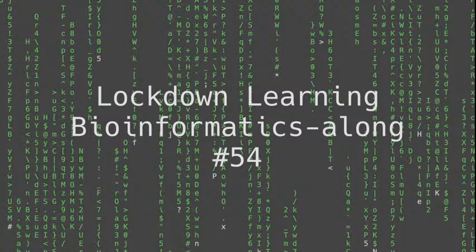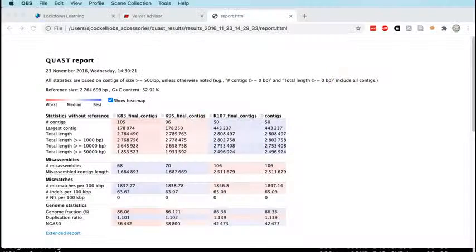So here we go. We've got some results from Quast here. This is a Quast report. You can see I generated it quite some time ago. This will have been on a course which the BSU ran here in Newcastle. I gave Quast a reference genome, so we've got a reference genome with a size and a GC content. And then we've got our assemblies here, which have been generated by Quast.